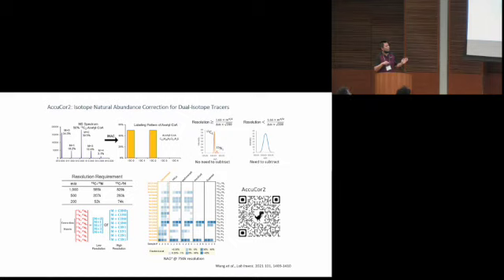In this case, you would have only 5 observations to solve 8 unknowns, which is mathematically not possible. That's why you need at least sufficient resolution to resolve the carbon-13 and the nitrogen-15. Then you will get enough observations to solve the problem.